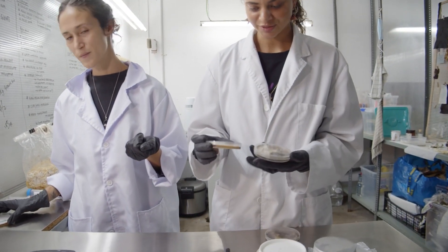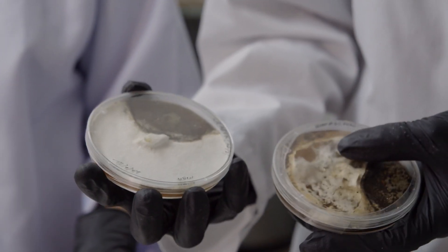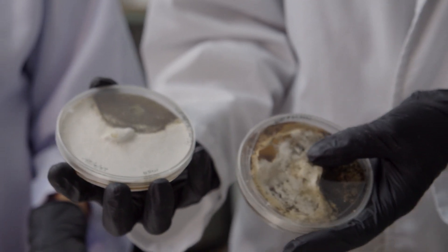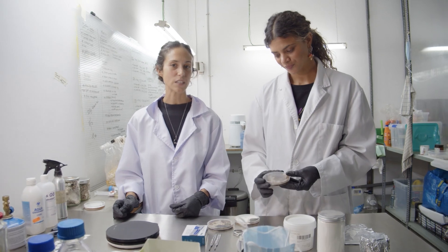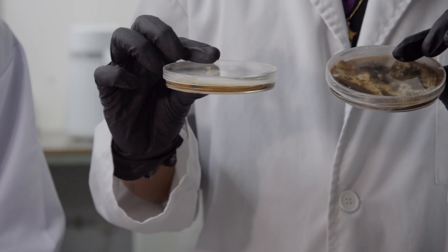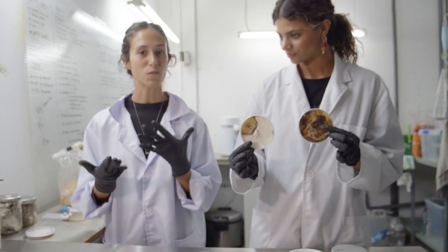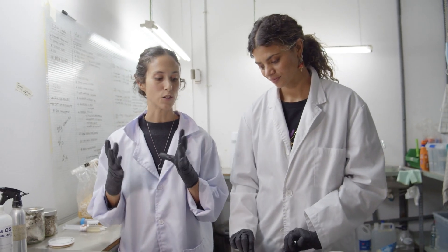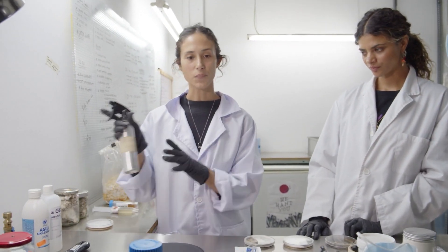This is what we do not want to happen, and it normally happens because of unsterile work protocols. You can get green molds — the most common called trichoderma — black molds, and bacteria which looks a bit more slimy. That's normally from touching your face or your phone while doing this work.